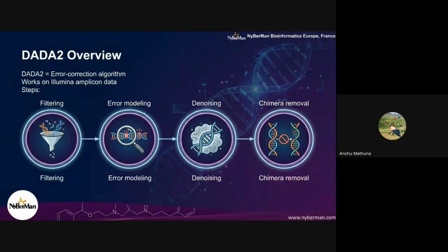Then it will learn the error rates from the data. It will go through the data and first model itself, that is, check what errors are there, and then build the model. It may also use certain previously provided data, which acts as training data for this model. After the algorithm learns the errors, it can implement that for a particular dataset.